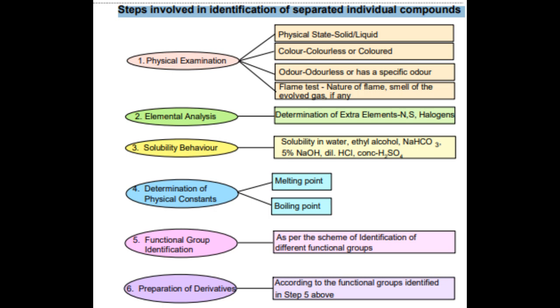1.4 Some procedures involved and correlating the observations with identification. Here, we will discuss the steps listed in Section 1.3 in more detail and the information derived about the compound after performing these steps. You will be recording these details in your practical notebook.